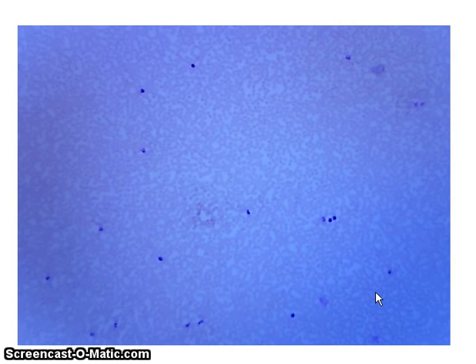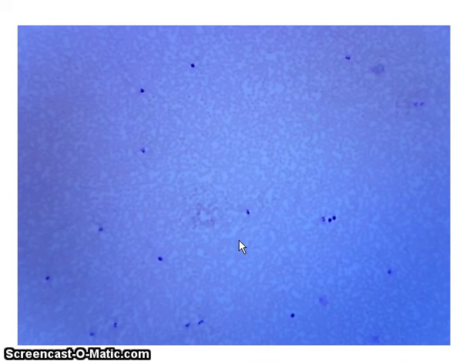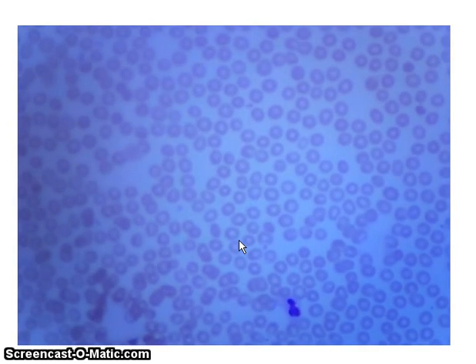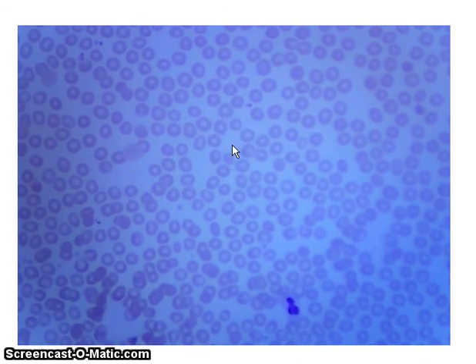Now, at this magnification, you can see that all these very symmetrical, very lightly staining cells, these are our erythrocytes. These are the red blood cells, erythrocytes. The dark staining ones, these are the leukocytes of this blood smear. Now let's go up in power again, up to 400. Now you can really start to see some detail on these red blood cells. And all we're going to learn for the erythrocytes is the cell membrane, and obviously the outline of these individual erythrocytes, that is the cell membrane of those cells.